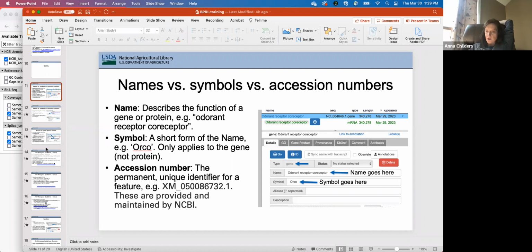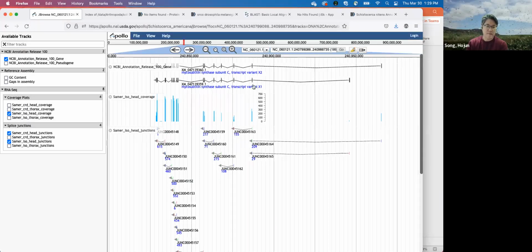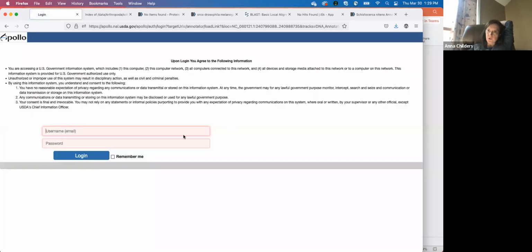If you've got, I assume, so what you're trying to say is you have something based on transcriptome data, so you have a sequence for it? Yeah, it's differentially expressed, but it's unknown. How do I figure that out? What you would do is take that sequence that you have and use the BLAST database to determine what gene model it would go to. You would do it in BLAST, and then BLAST will have a link that'll open it up in Apollo for you. Okay.